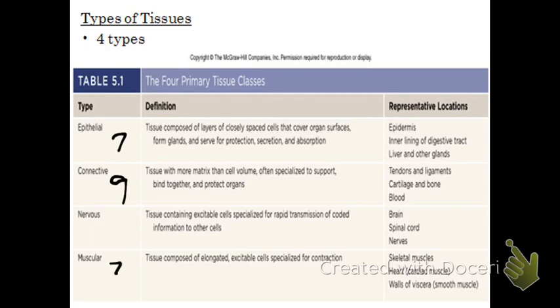In your body, there are 3 different types of muscle tissue. There is skeletal muscle, cardiac muscle, and smooth muscle. Again, we'll go through those details. You'll get to recognize each of those. And then we're going to give you a quick look at one nervous tissue slide. So these 20 tissues will be your focus for this lab, learning to identify them, learning where in the body they're located, learning some special characteristics about each, as well as understanding how these tissues then become the building blocks of organs.